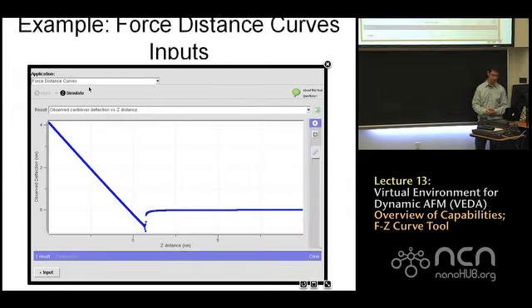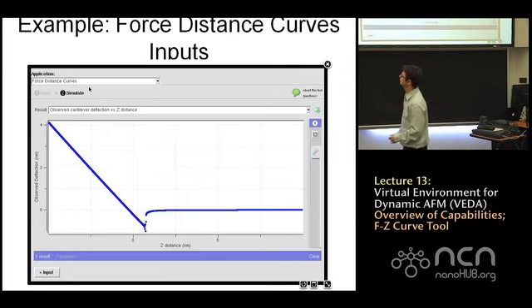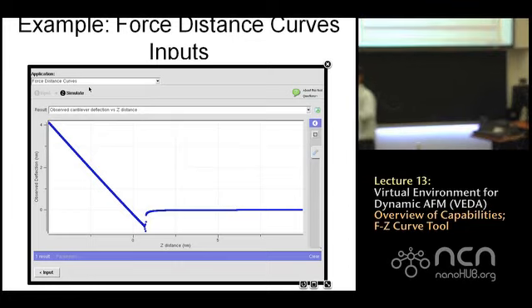Now, if you just look at the x-axis, it's z. So it's basically F versus Z, an important distinction. From the drop-down menu of the results, select observed cantilever deflection versus z distance. I don't think it's the first one that comes up, but there are several plots generated in the simulation.